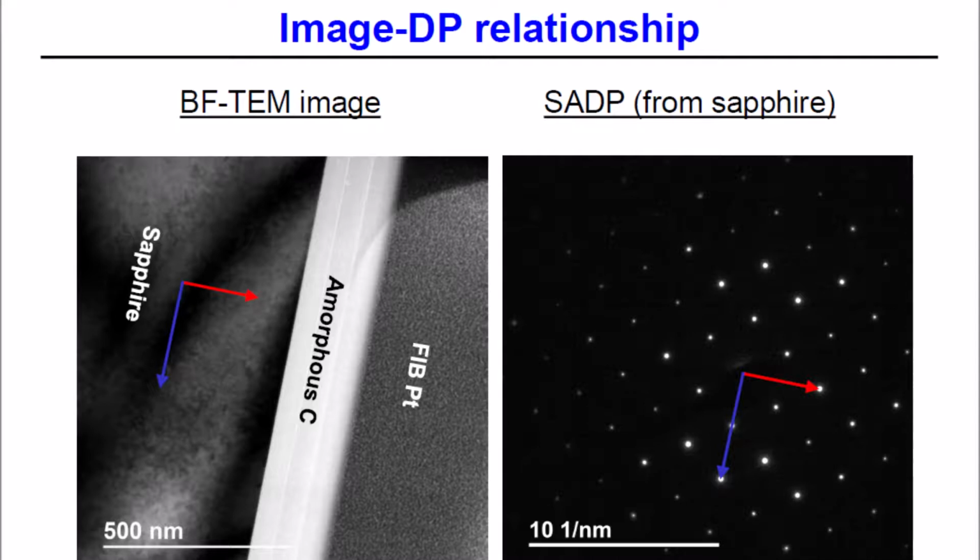The good news, if you're working on a Tecnai though, is that when you start in M mode and you go all the way through MH mode, the image never rotates. Okay, so the orientation of your image never changes irrespective of your indicated magnification. Again, as long as you're in M mode through MH mode, and of course SA mode is included in there. And those are basically the bulk of the magnifications that you're using for imaging anyway.